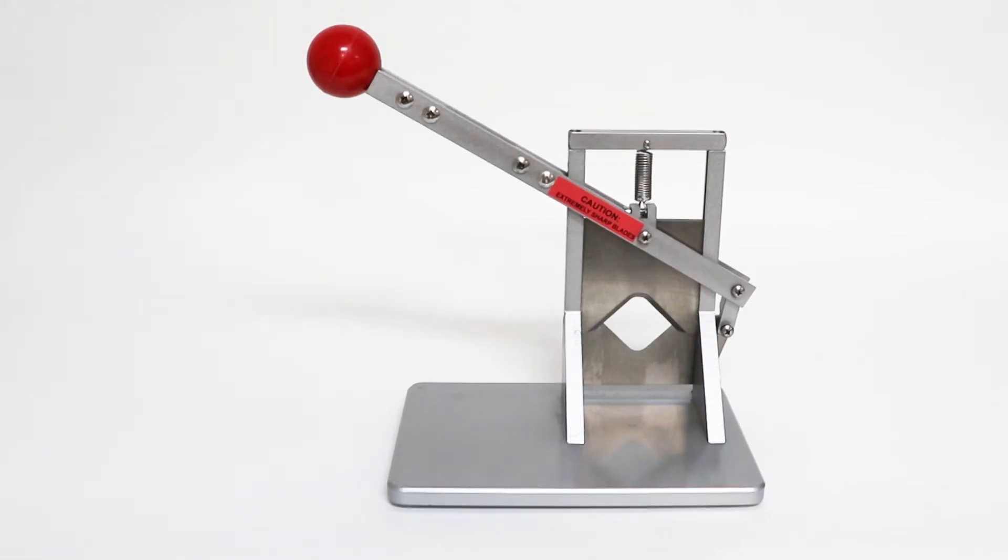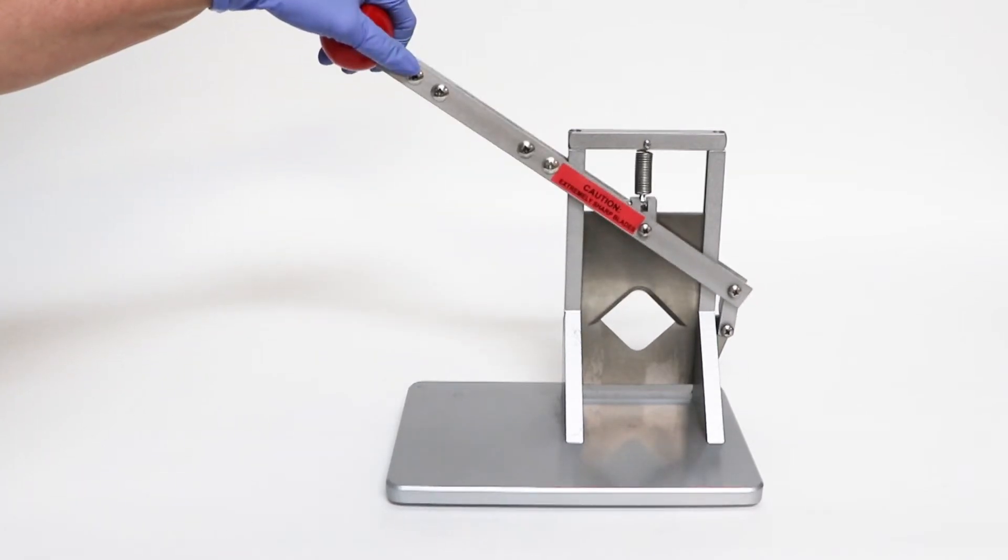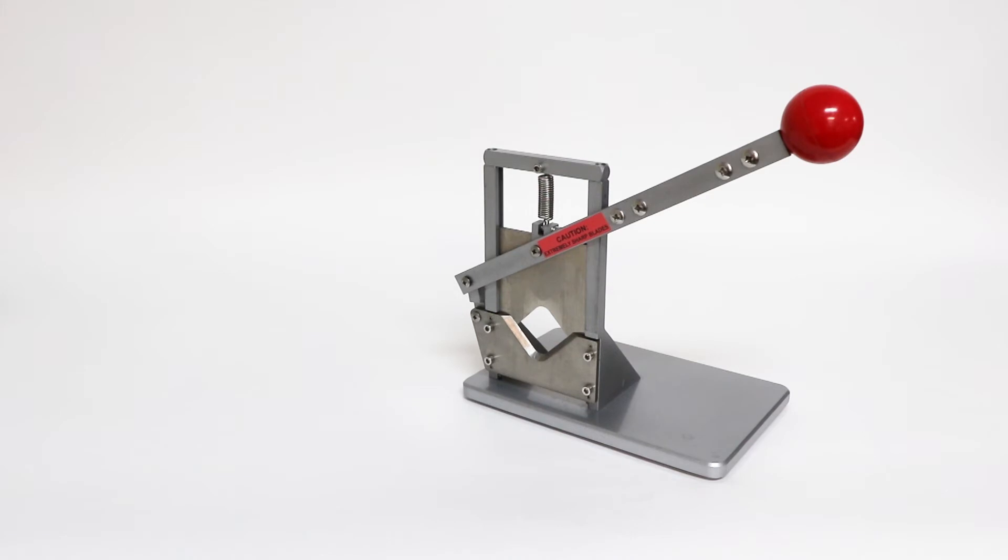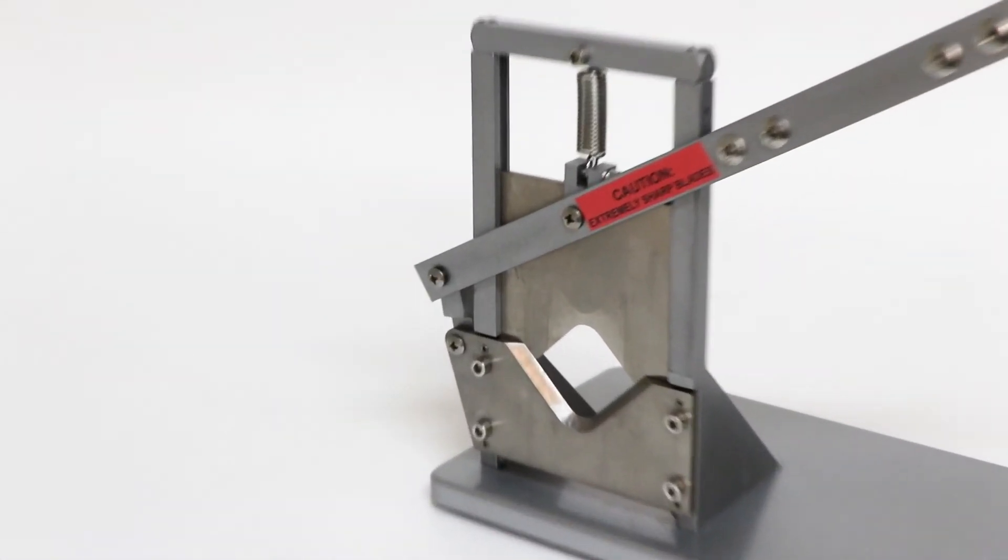The guillotine is considered one of the most humane methods of dispatching laboratory animals. With a single downward motion on the handle, you can euthanize a rodent quickly and without trauma. The blades are comprised of hardened steel so they hold an edge and remain sharp, offering years of service.